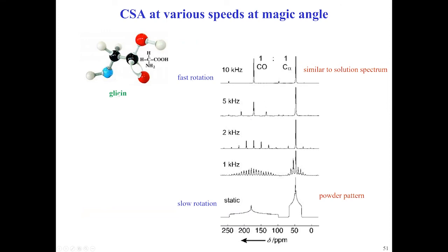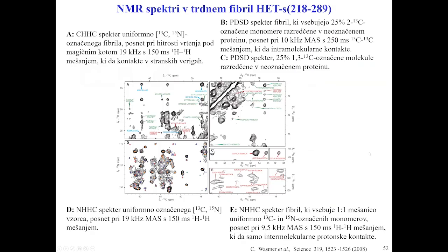So as proof, if this is glycine, there are 2 carbons, clearly we see the carbonyl and we see C alpha, right? And we say, wow, wonderful, we got the right compound. But if you want to understand how they orient, what's the angle with respect to something else, you want to go back to this state. And he will be talking, I'm sure, about recoupling and all these fancy ways to restore this information, because this will tell you about dipole-dipole interaction and so on.